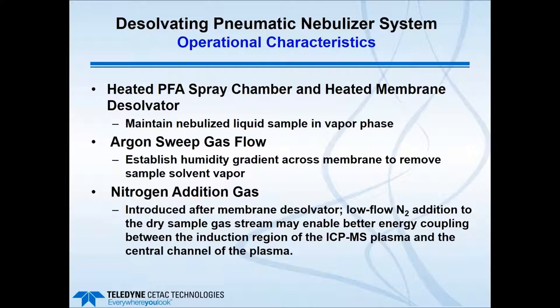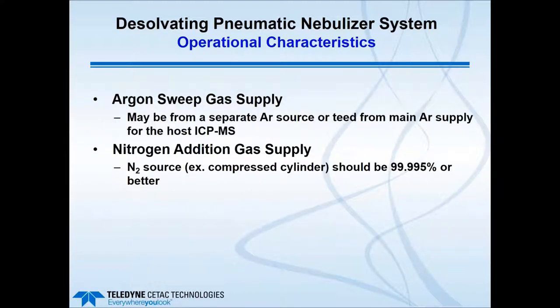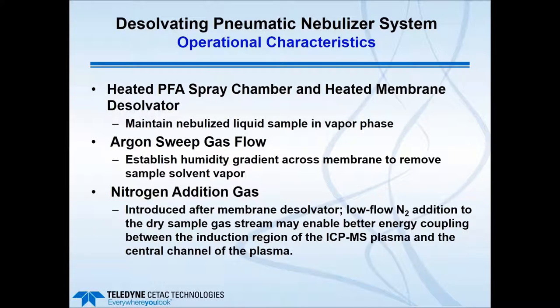Of course, you can't add too much or too little. There is a right amount to add, and you would, of course, observe that in the ICP-MS tuning. But it is an important part of the overall experiment, and it usually will give you about a factor of two improvement in addition to the heated sample aerosol when you use the system as a whole. There are instances, and I'll show those, where you may not be able to use the nitrogen.